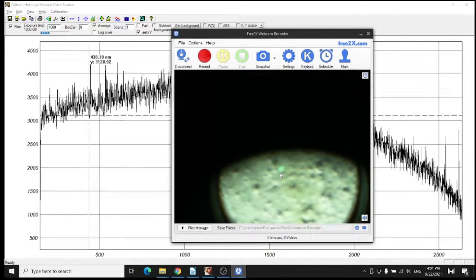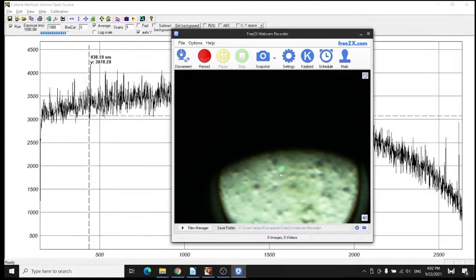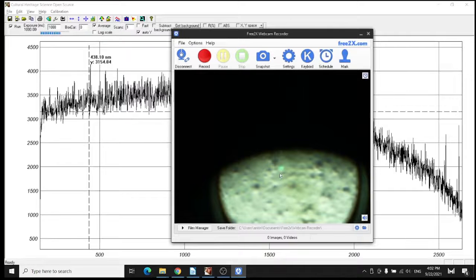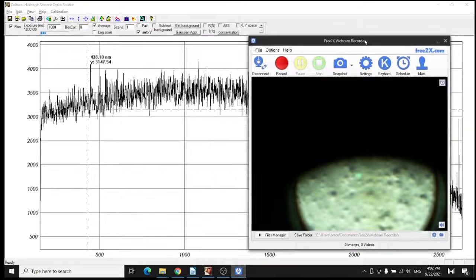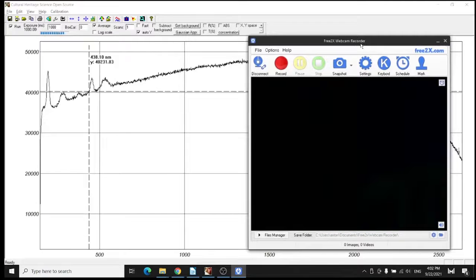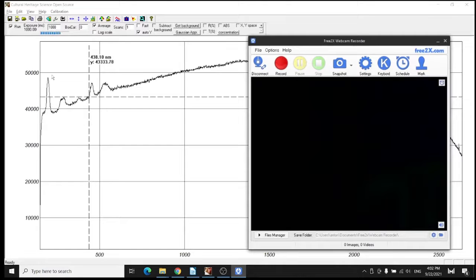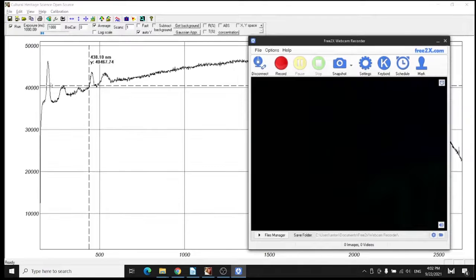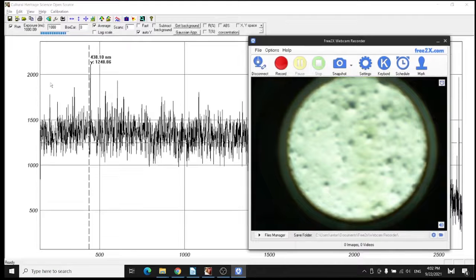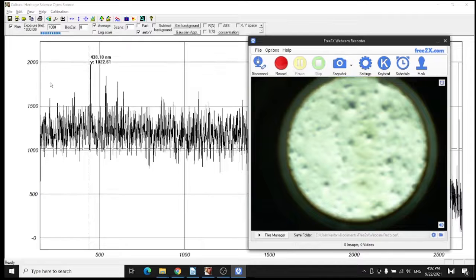In particular, when we analyze small decorated objects like manuscripts, where we want to analyze very tiny lines, that will be very important. Let's look at the spectrum. Now I lifted the camera, so we are acquiring the spectrum, and we see the peaks very clearly. When I'm observing the object, of course there is no Raman signal going to the detector, so we don't see anything.